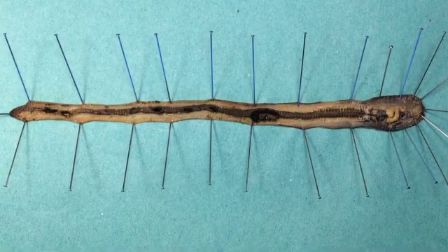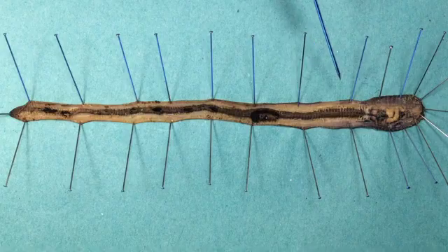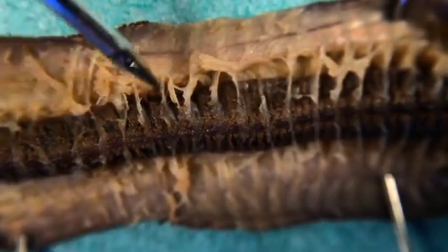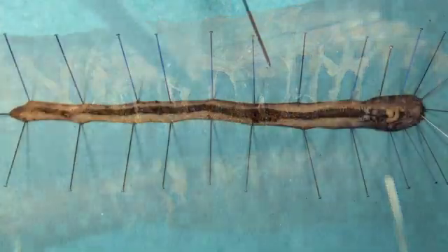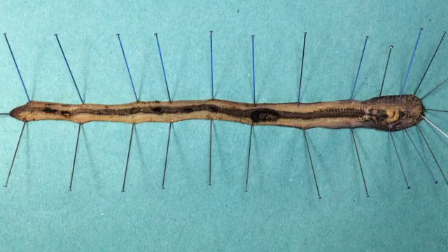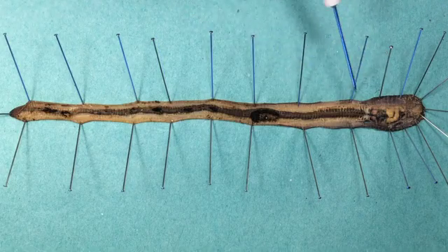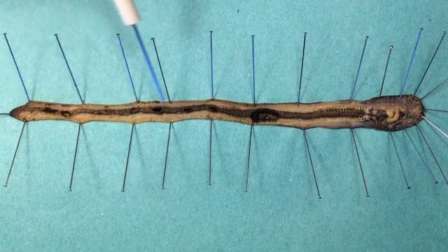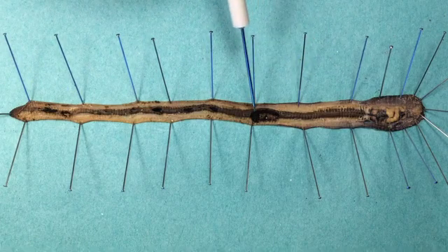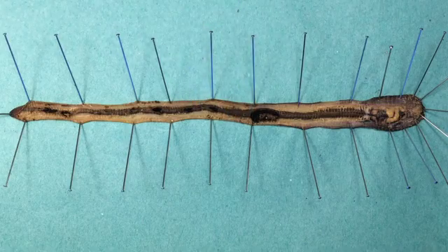So what can we see? Starting with the coelom, which is the space between the body wall and the gut. This is normally filled with coelomic fluid, and this space is important because it allows the body wall and the gut to move independently. It also acts as a hydrostatic skeleton so that the worm can push through the soil. Moving on to the digestive system — this is really obvious: it's this blacky-brown tube running the whole length of the worm, because worms eat humus and it's still there inside the digestive tract.